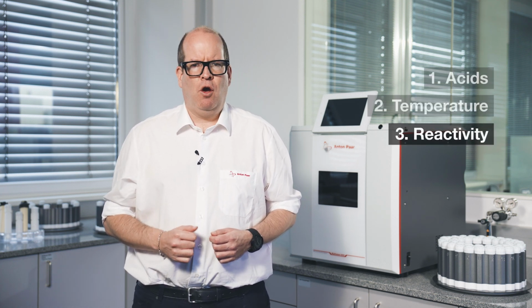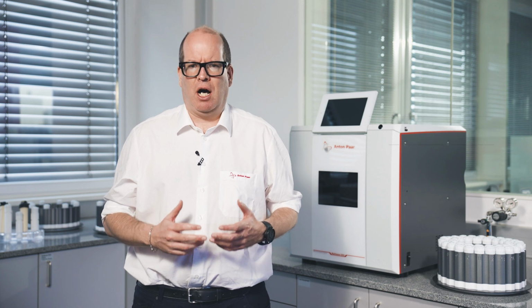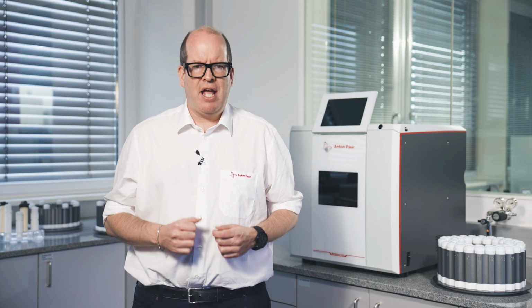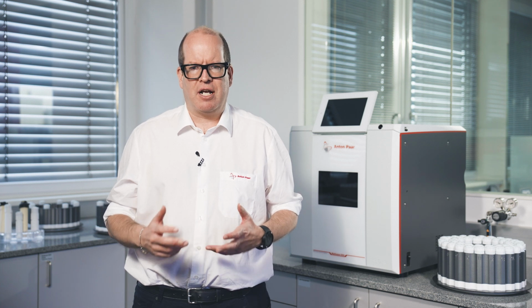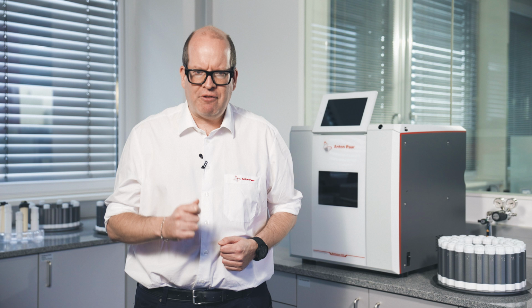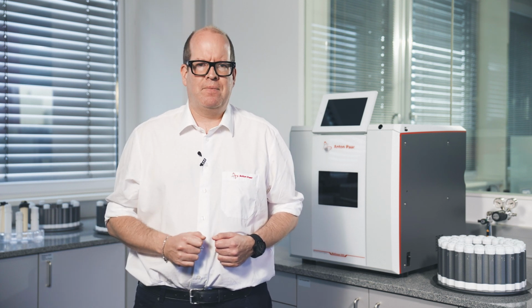For example, when you heat high amounts of a highly reactive sample quickly to high temperatures, the exothermic behavior during digestion may lead to an explosion because a lot of pressure is built up and released immediately. It's no joke. Check out our video on heavily reacting cough mixture right here.